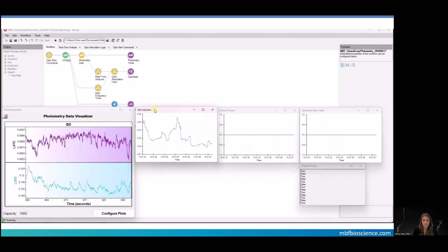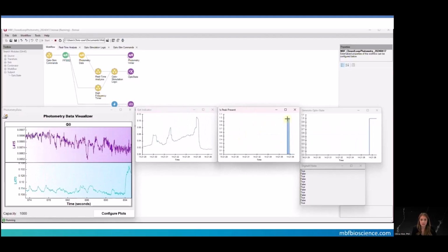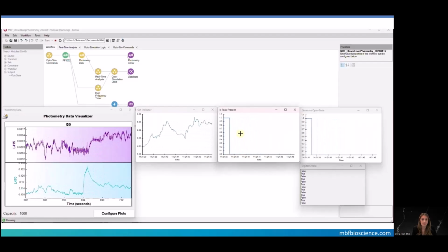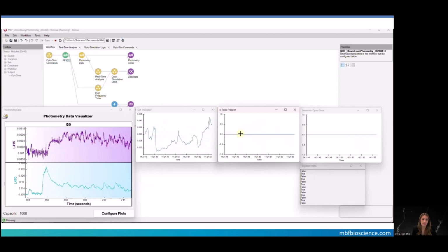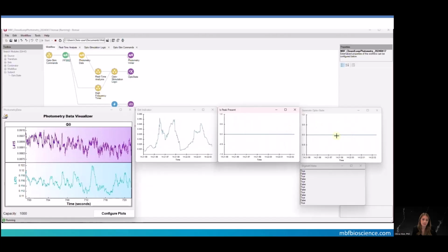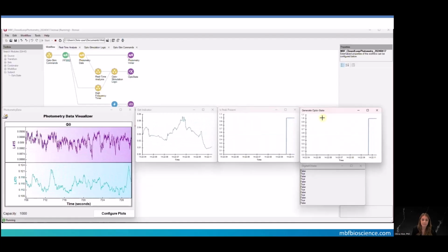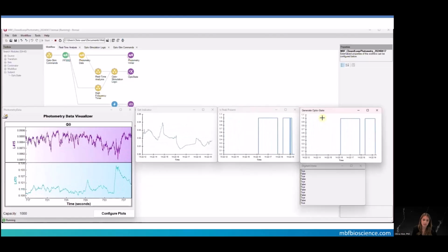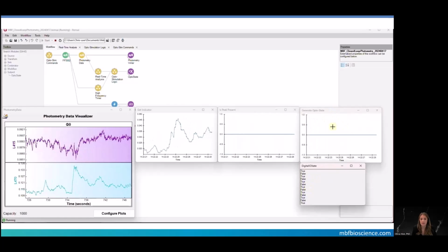We then use an indicator cutoff value to determine if a peak is present, and that is shown in here. So right now there are no peaks present, but soon this will turn high, which means it detected a peak, which is shown here. Once we have a true or false value determining whether a peak is present, we add some additional logic for determining whether optostimulation should be started. In this example, when a peak is detected, the logic starts a 1 second duration optostimulation pulse train. This can be seen in the generate optostate visualizer. We conclude this workflow by passing the optostate signal back to the beginning of the workflow, to generate start and stop stimulation commands to be sent to the FP3002 node. You can see the laser was successfully triggered by noting that this digital I/O state alternates between true and false, while this generate opto state is 1.